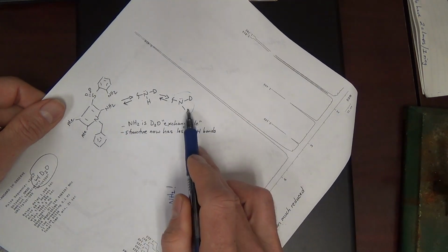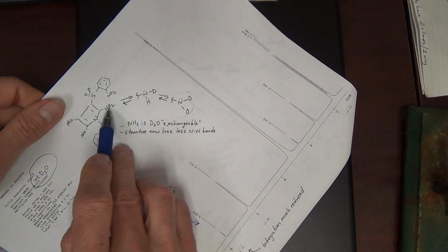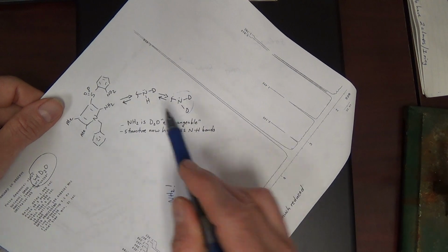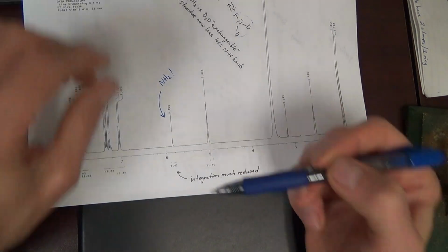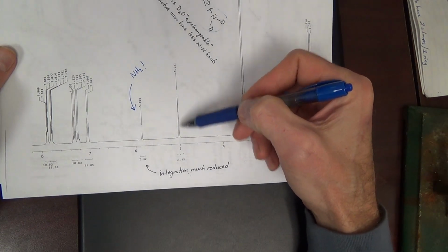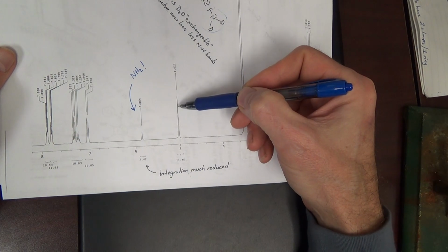You're probably never going to force it all the way here. But as it goes to the right here, you diminish the amount of H that's there and the signal gets lower. All right? Where the CH2 did not diminish because it's not exchangeable.